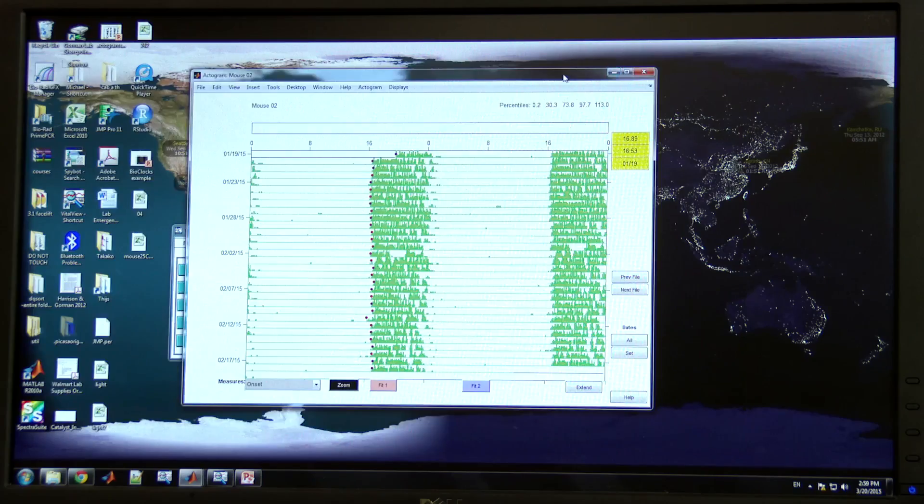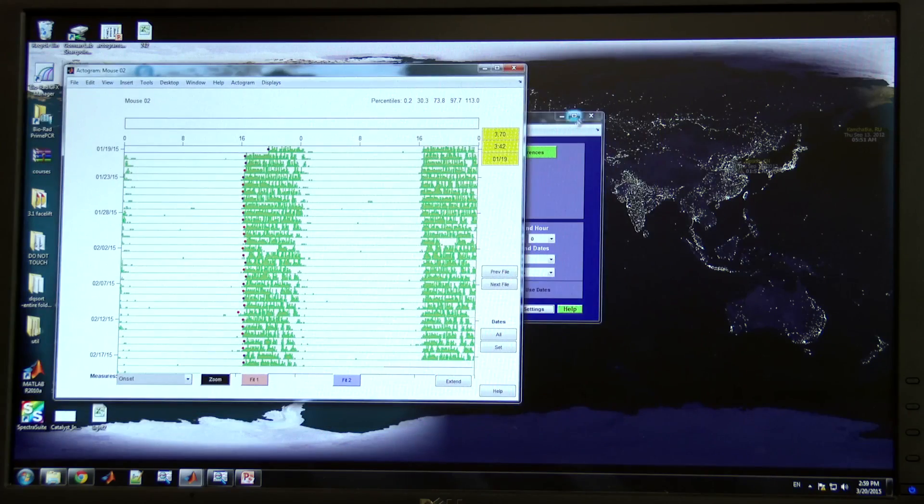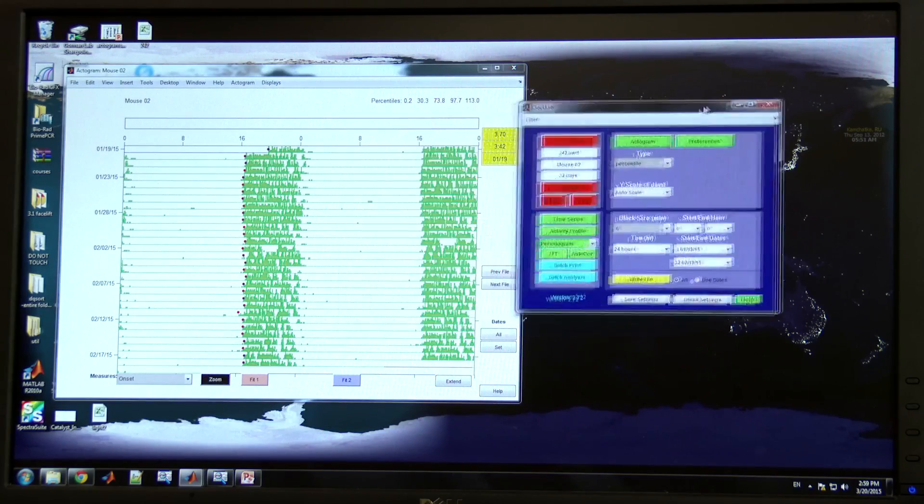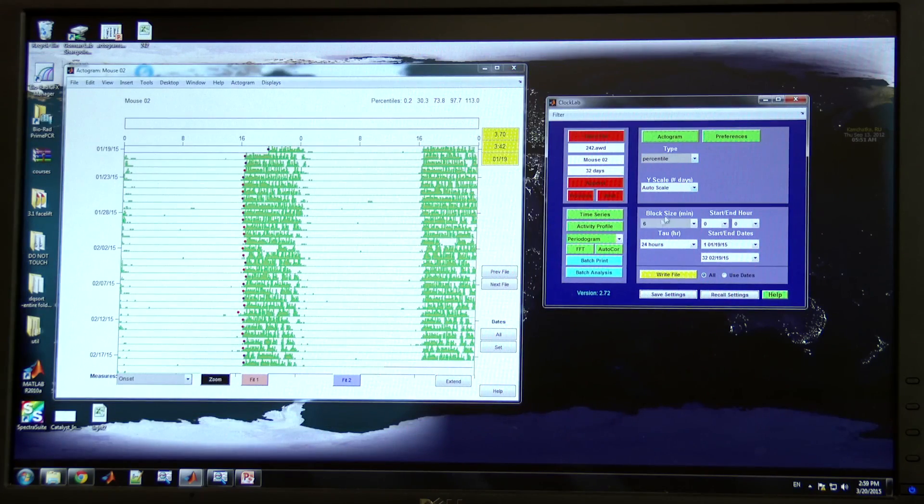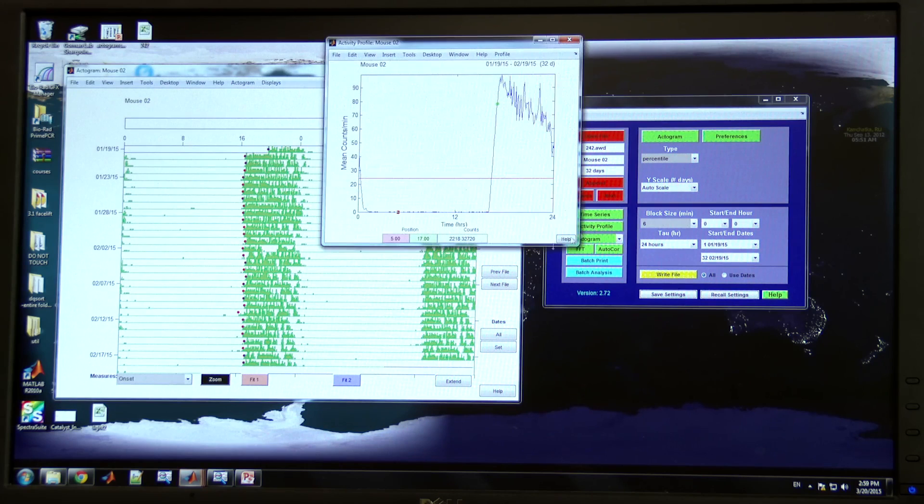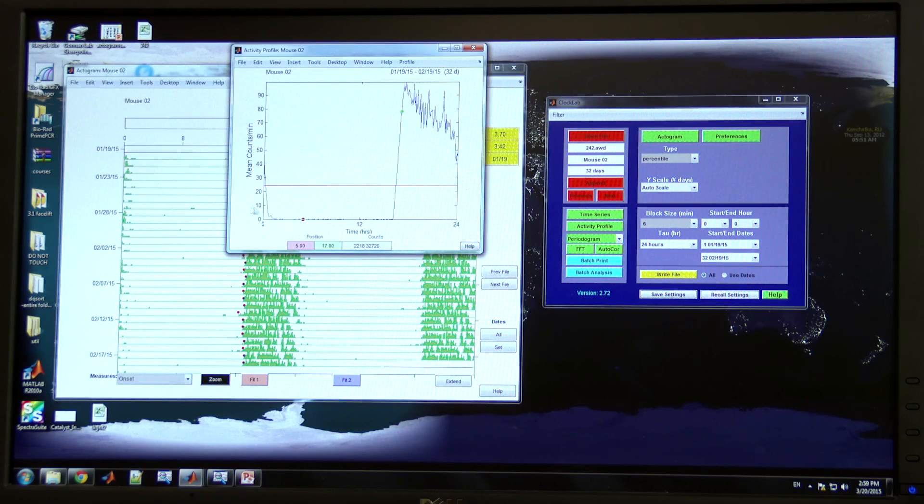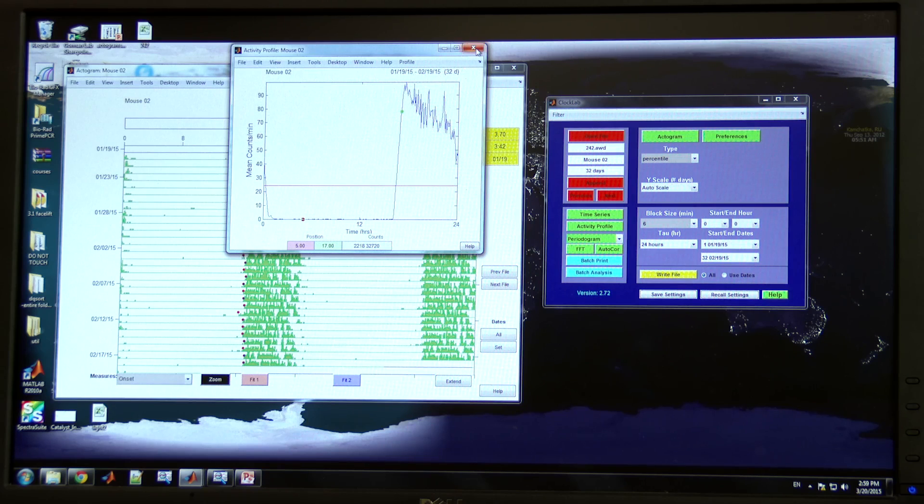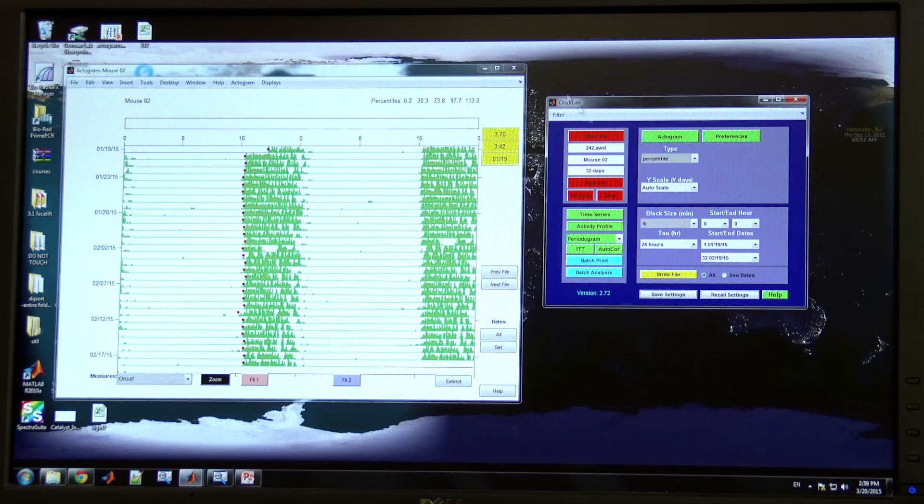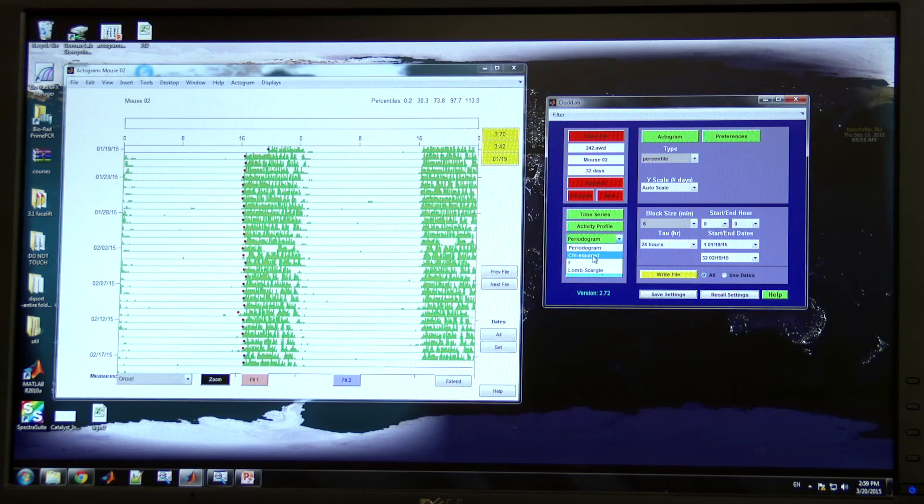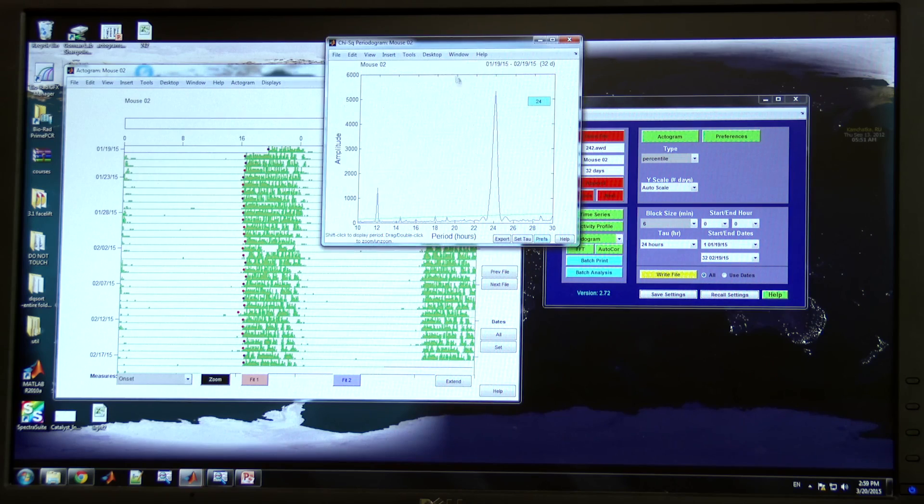Another thing that you can do besides create an actogram in ClockLab is there are a number of tools for analyzing the average pattern of activity over 24 hours and some statistical analysis that we use to measure circadian rhythms.